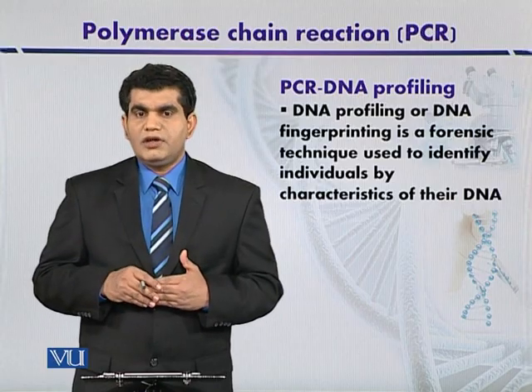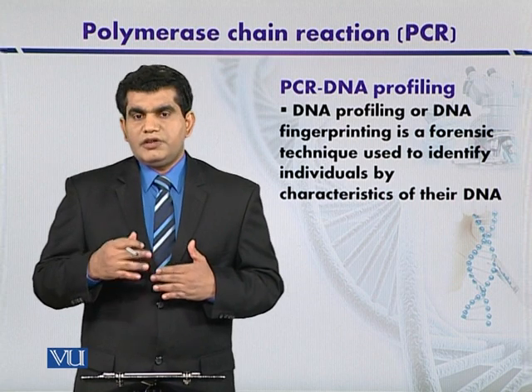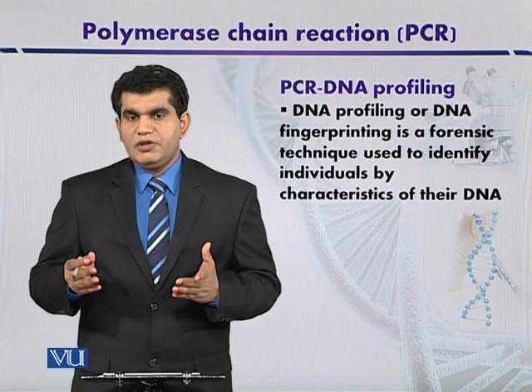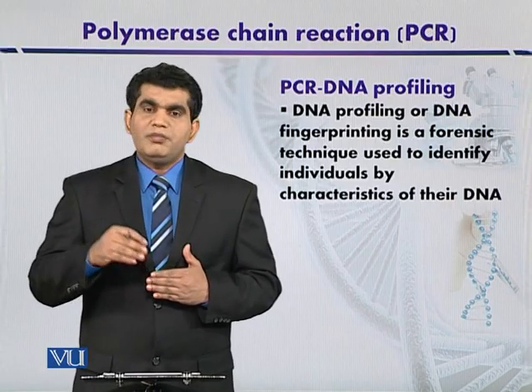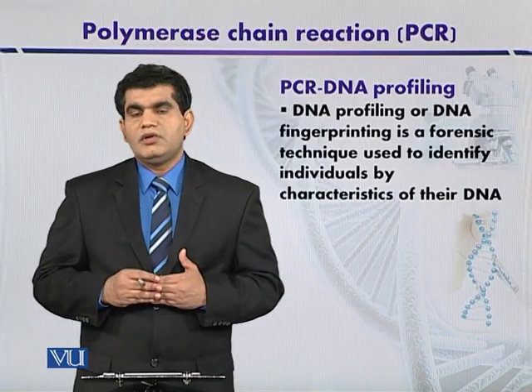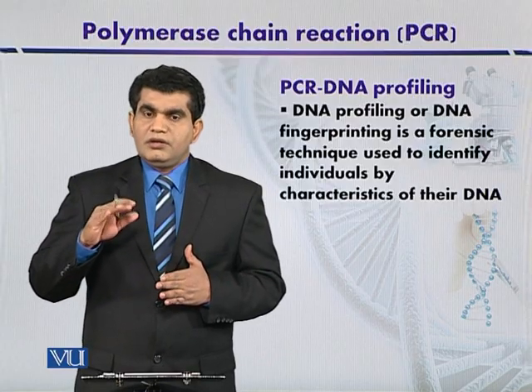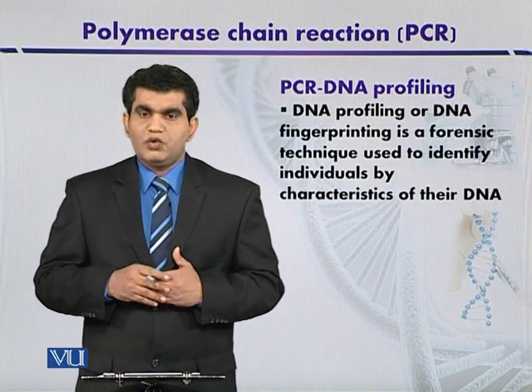DNA fingerprinting, I just explained to you, here we can use restriction fragment length polymorphism and its modified form, AFLP. So we can extract the genomic DNA from the evidence, tissue, or blood sample that we have collected, and then digest it with a restriction enzyme after the extraction of genomic DNA.